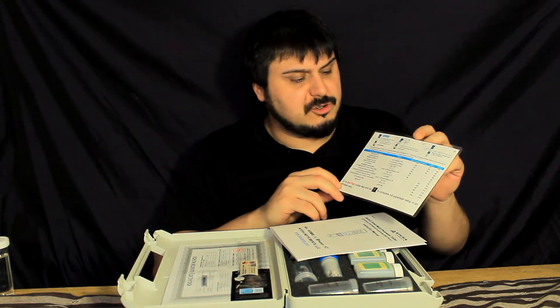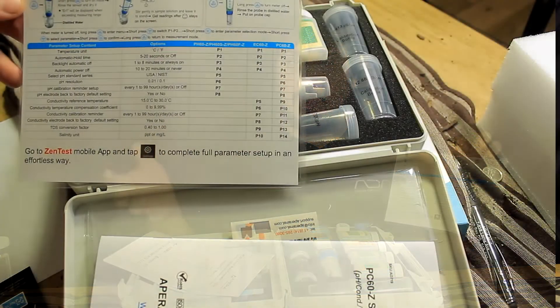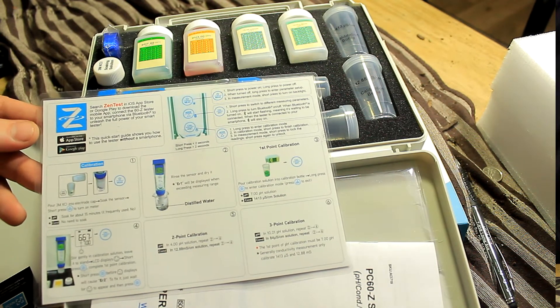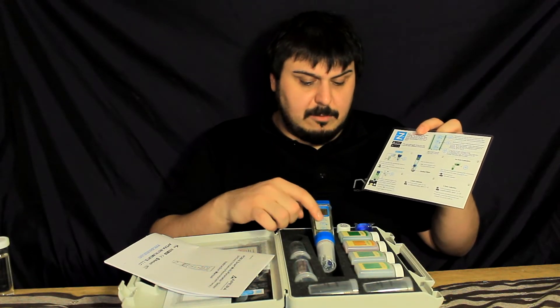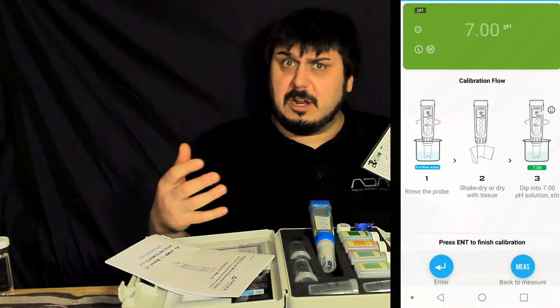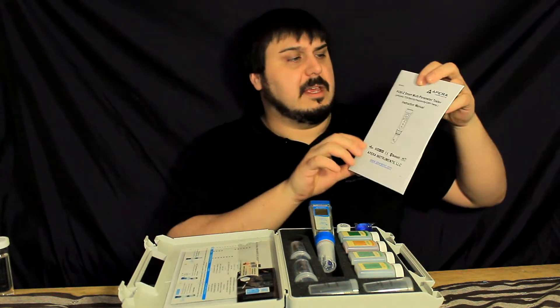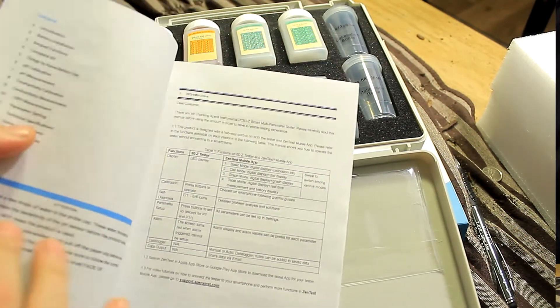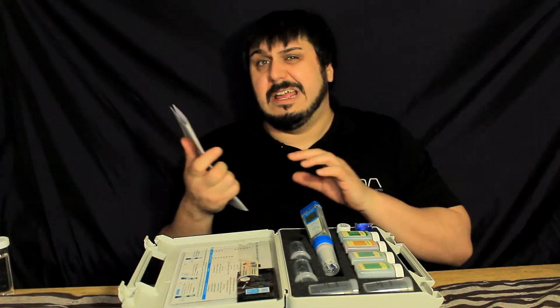Next we have instructions on how to program the unit. You can do it within your smartphone, which I recommend because it's a lot easier, but you can also do it in a hybrid style directly on the meter itself by pushing certain buttons. It also tells you how to calibrate. It also comes with a manual which is very well written and covers everything you need to know about the device — how to set it up and basically everything there is to know.